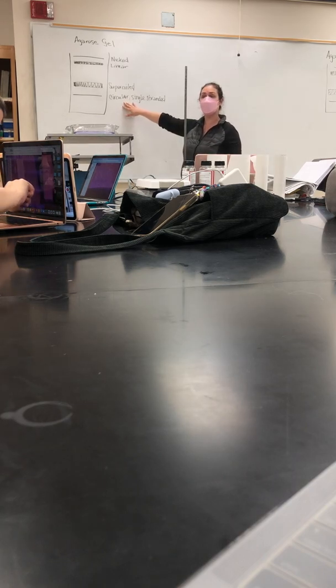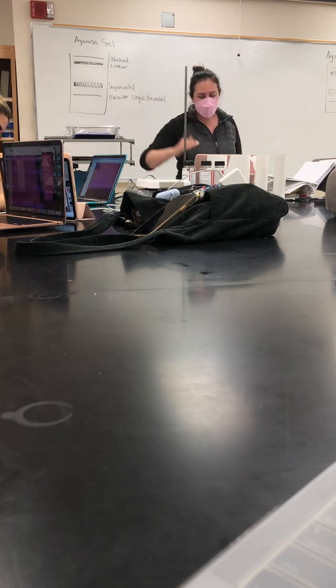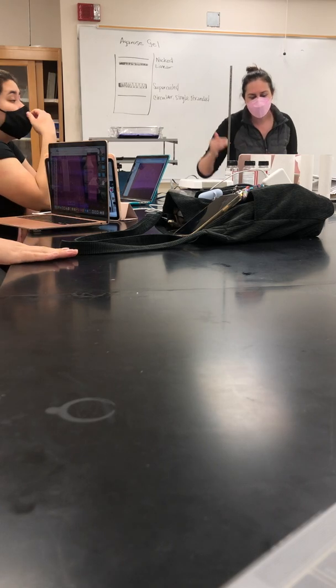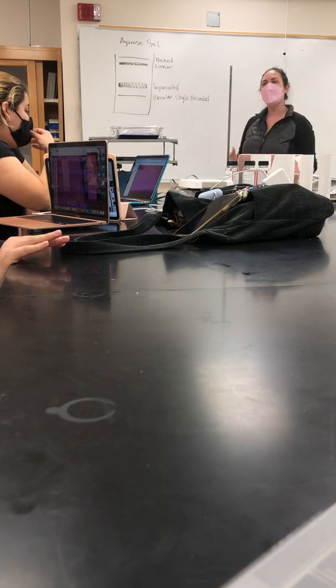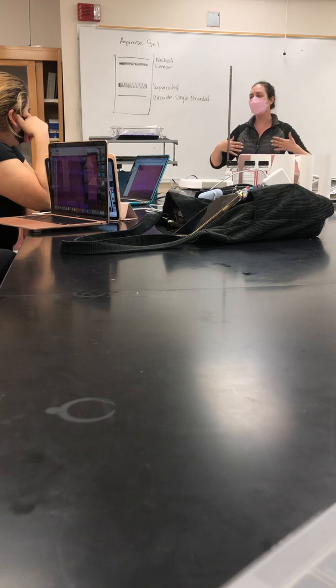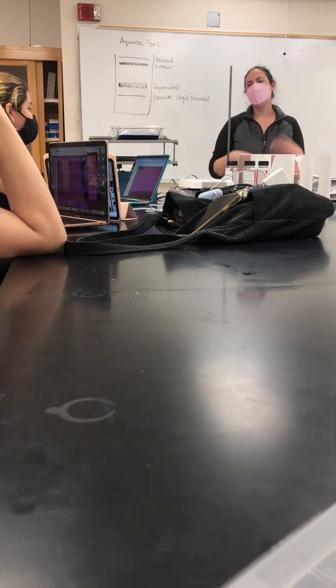Wait, so what's the bottom? Like, see the circular? Not in the picture. Oh, in the picture, that bottom one, I'm looking at the positive control. The positive control, which is on the left-hand side, so that bottom band is just extra stuff. Oh. So those are things that we just weren't able to pull because I didn't run it off the gel. If you guys remember, I went 3/4 of the gel. So that's just extra stuff. That could be some of your circular single-stranded DNA as well. But more than likely, it's something else.